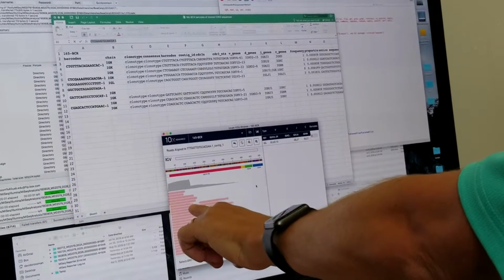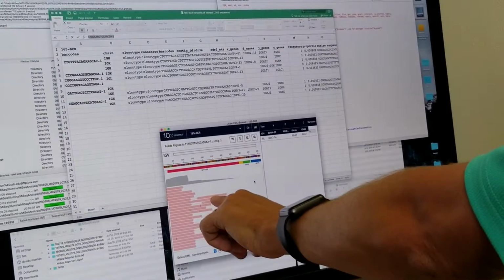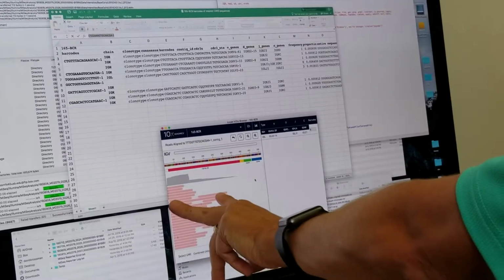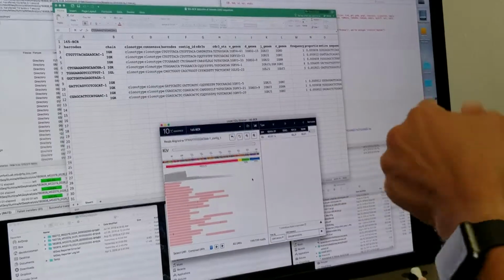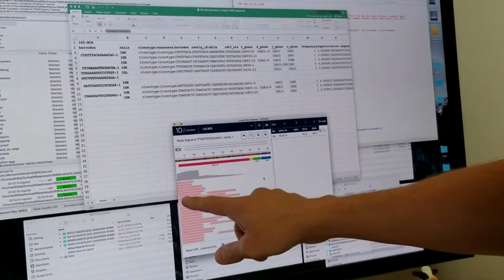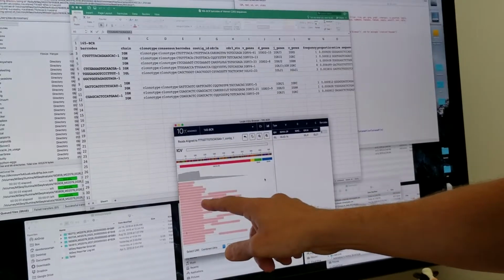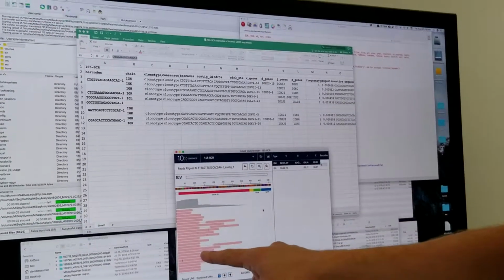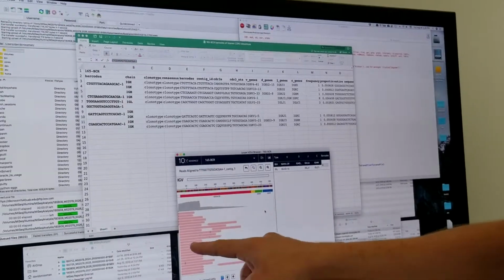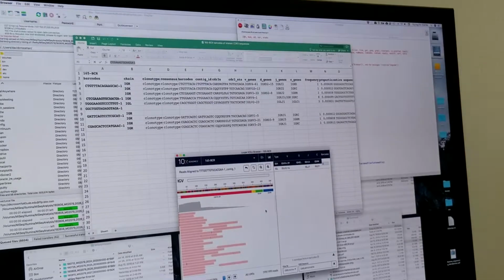So this is read 1 here, and then you have a line that separates it from read 2. These two were sequenced like this, and you had a small insert fragment. The other one here looks like it was just all one. Here you have another one that is paired-end for sure. You can see the nice one. Others, like this one, are a lone mate; its read 2 was who knows where.